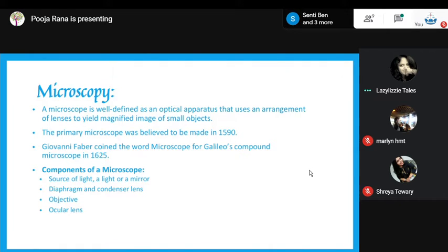All right then. So let's move ahead. We were talking about micrograph, right? Now, initially, the images were taken by photographic film, but contemporary developments in charge-coupled device cameras permit the storing of digital images. So these digital cameras can be used for taking the photograph of enhanced images.